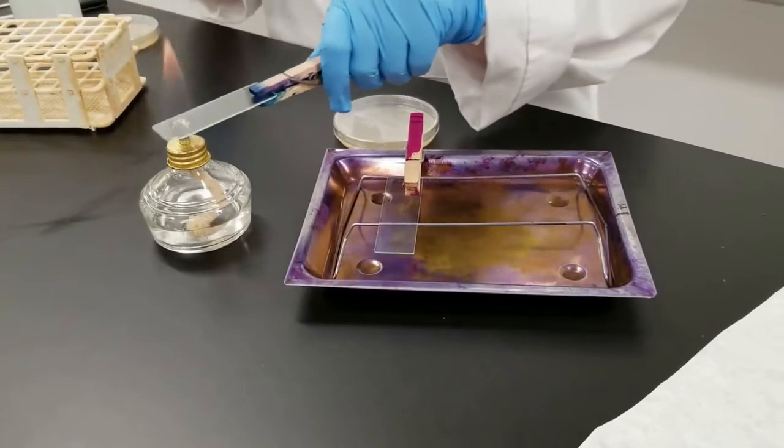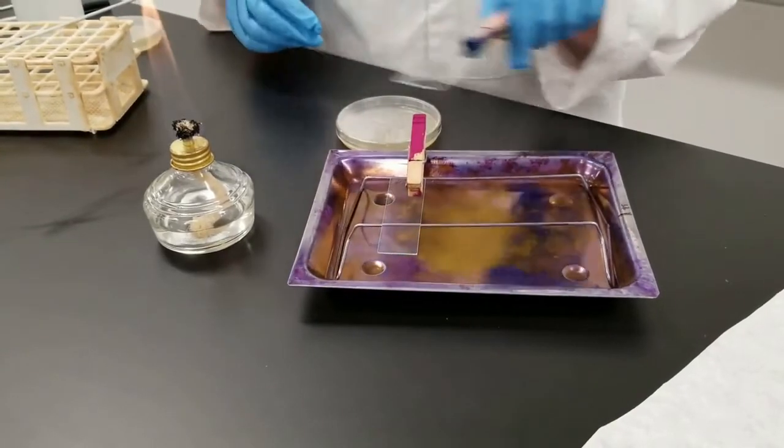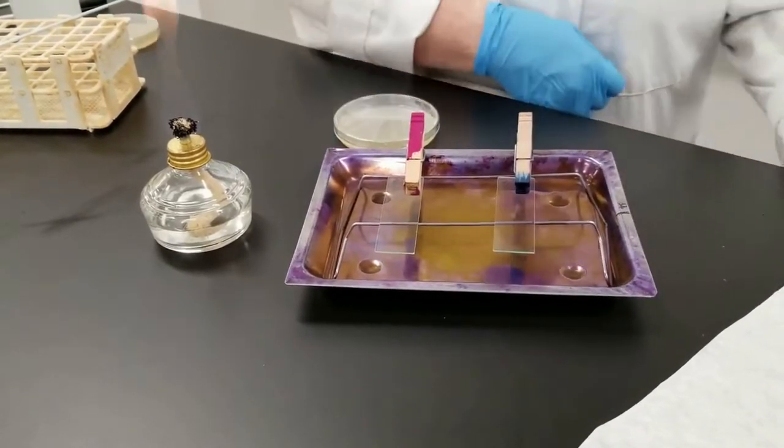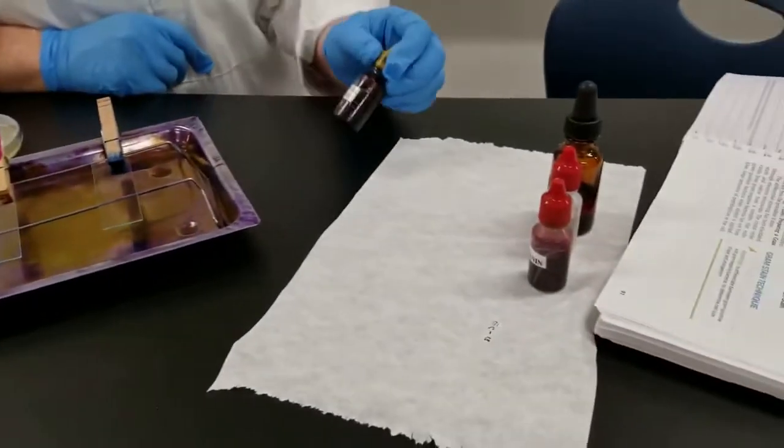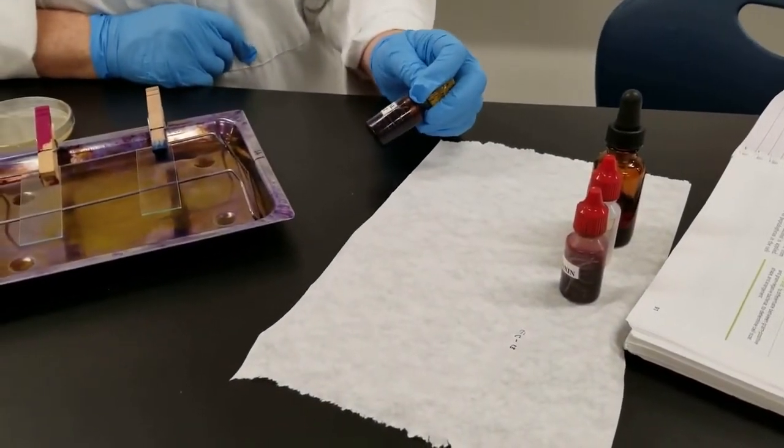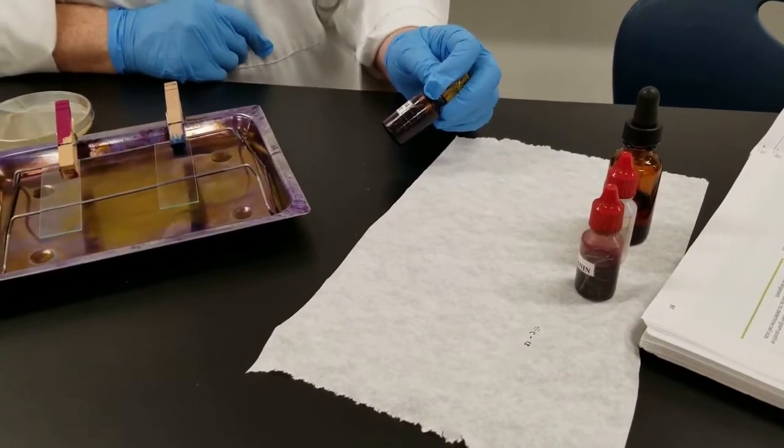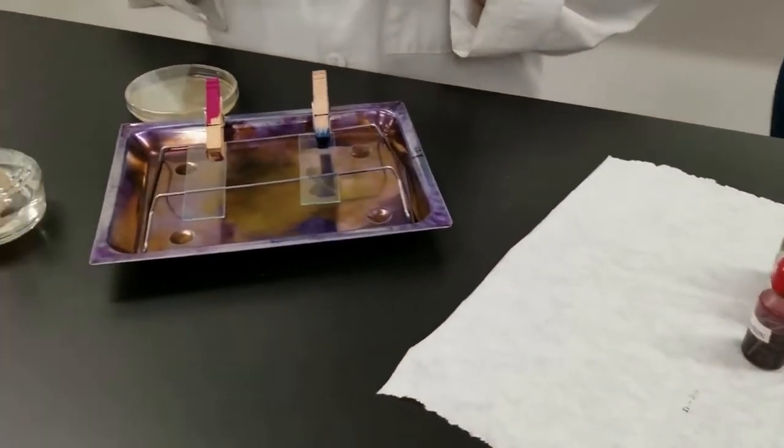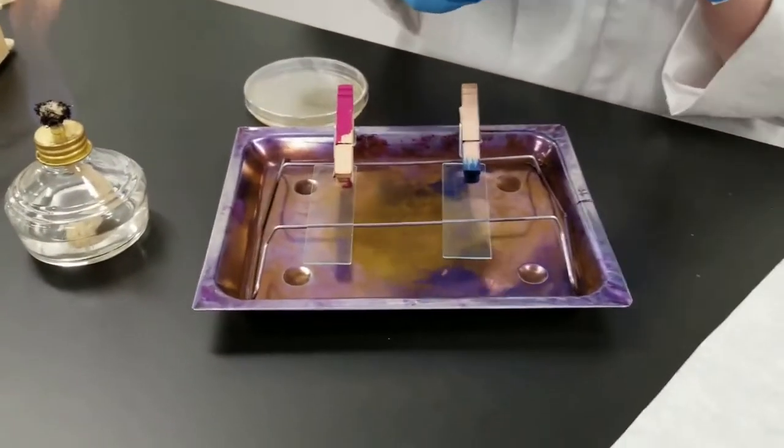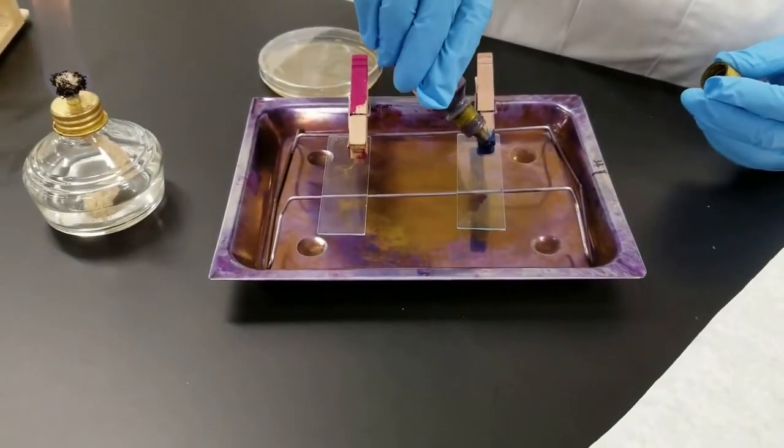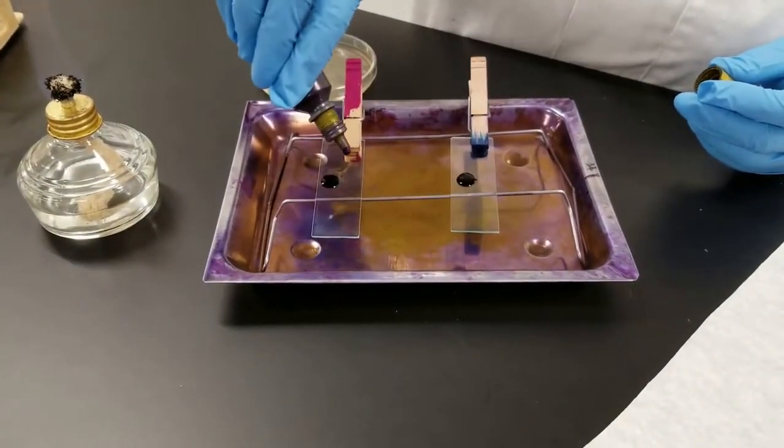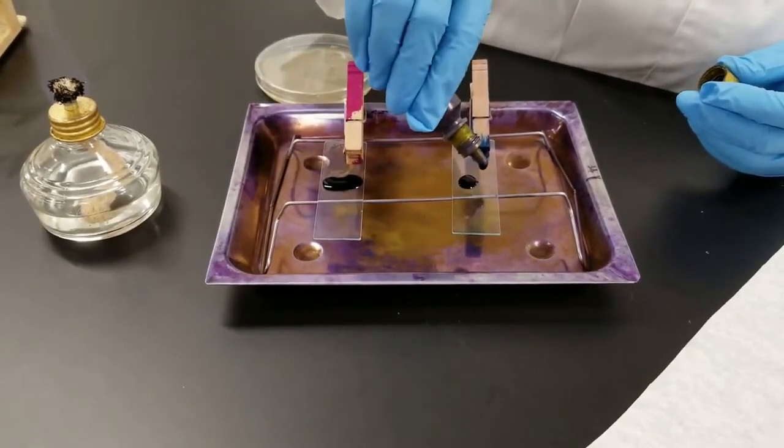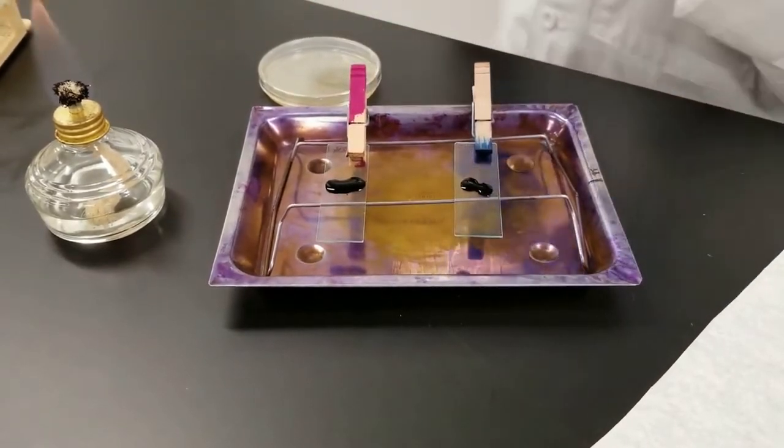And I'm now going to heat fix. Pass the slide through about three times. Now with the Gram stain, there's four different steps to this. The first step, we are adding Crystal Violet. We need to keep track of the time. We're going to add this, and I'm going to do both slides at the same time. Try to add a drop over the top of where you did your smear. You may need to add a couple drops on there, and let that sit for one minute.